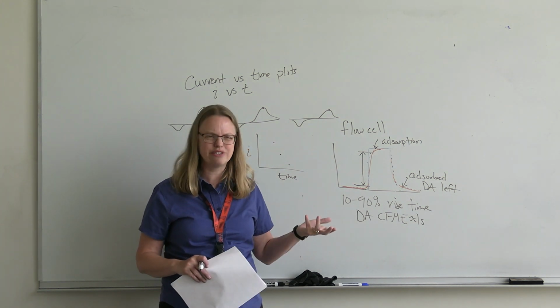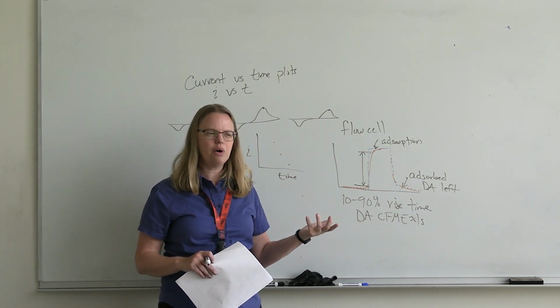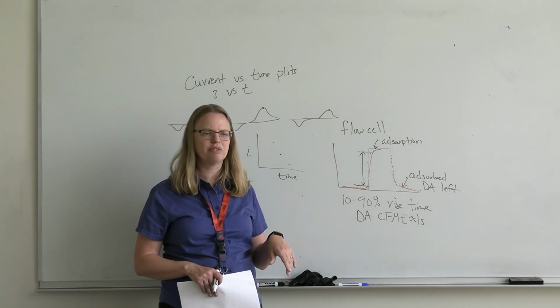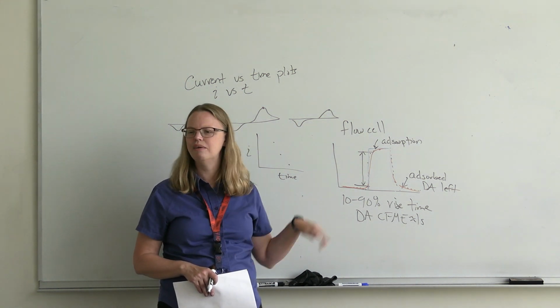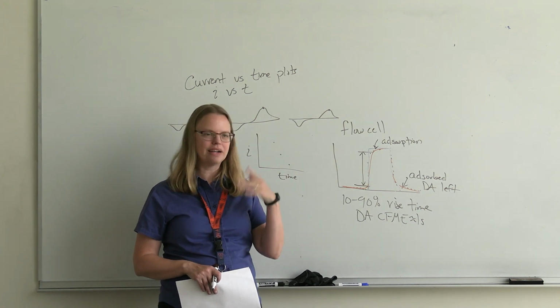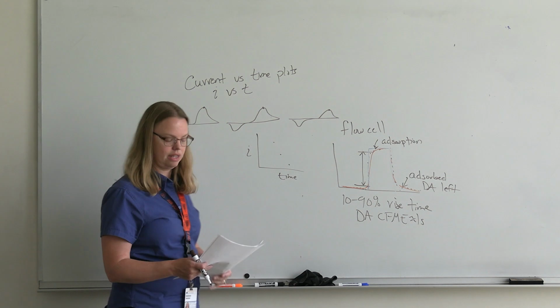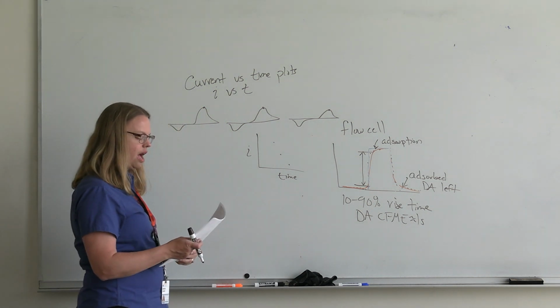You don't want to look at 200 CVs. A lot of other data analysis techniques put out a line plot. For fluorescence, this is how the fluorescence went up. Amperometry would put out a line plot, et cetera. So people are used to looking at line plots of how things change.